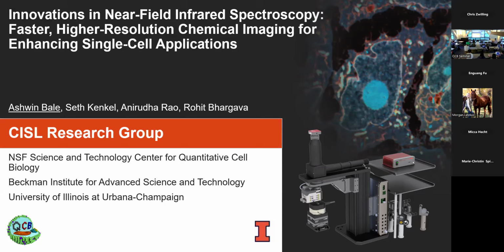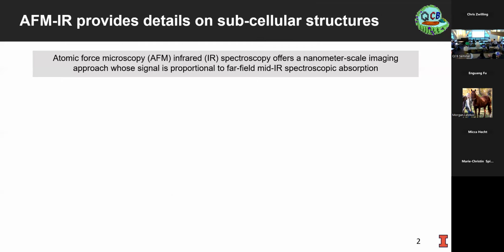Hello, everyone. So for today's talk on innovations in near-field infrared spectroscopy, we will mostly be covering, as I mentioned, AFM-IR, which is obviously atomic force microscopy coupled with infrared spectroscopy, which offers a nanometer scale imaging approach which can be combined with the chemical information.